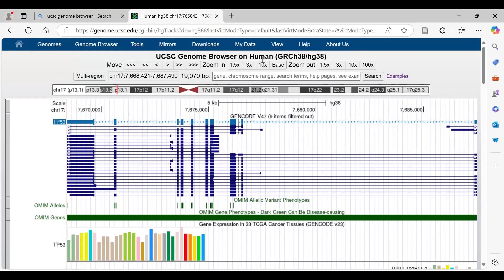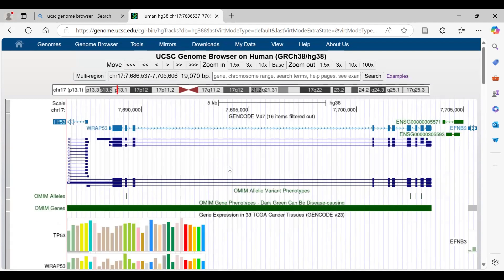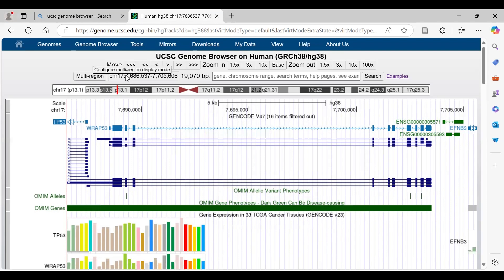This is the UCSC Genome Browser on human, and this is the name of the assembly. These arrows give us commands so we can move left or right along the sequence — you can see it has shifted. Zoom in and zoom out options are available for adjusting the level of visualization. The multi-region section gives us the position of the chromosome or the position of the input query we are interested in.